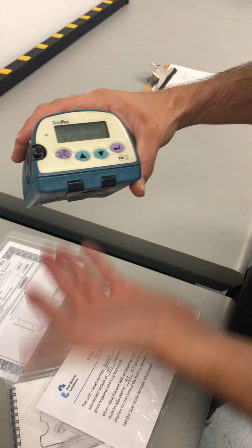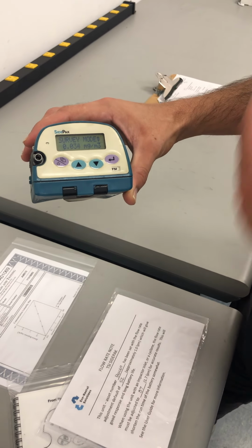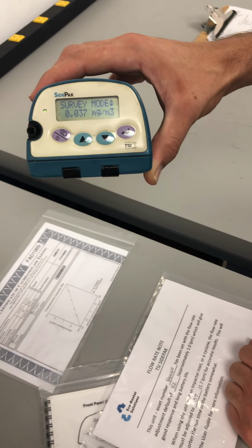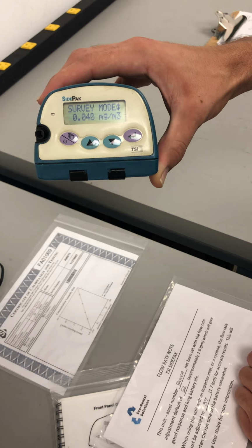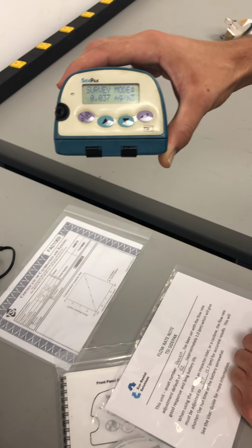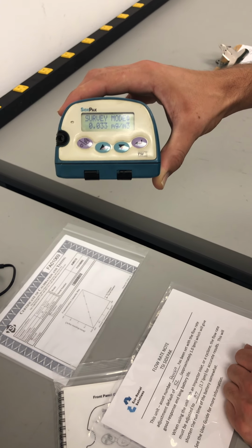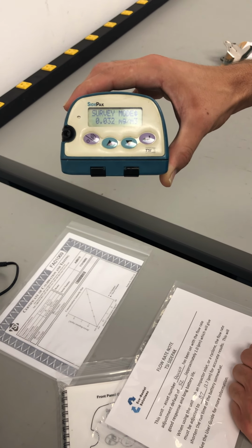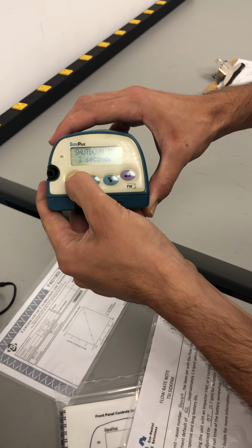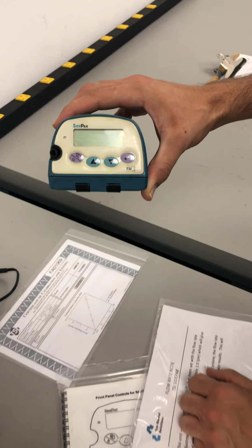So once you're done, if you've done your zero calibration, if need be, right there we would be writing down the number 0.045. The milligrams per cubic meter are going to be written on the table, so you don't need to write the unit there. Okay. And that's it. Then we're good. Turn it off. Hold it down for a few seconds, and it'll turn off. All right, great.